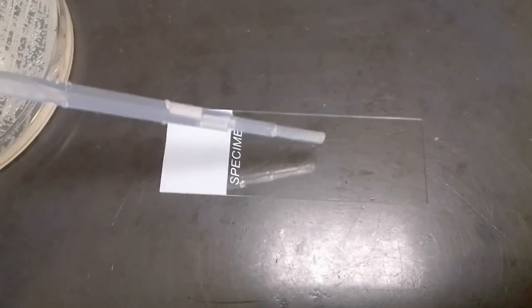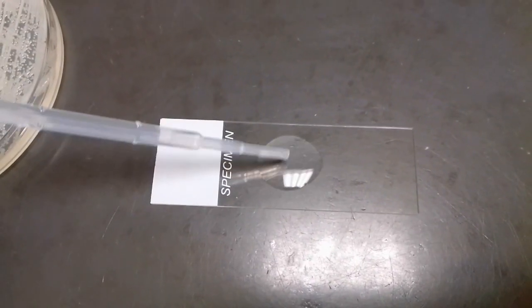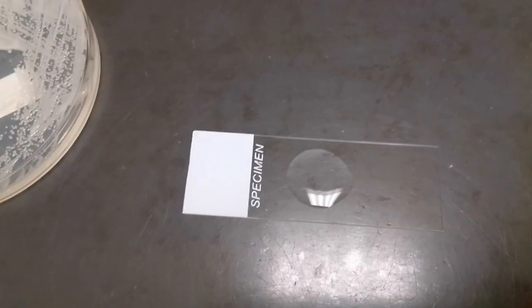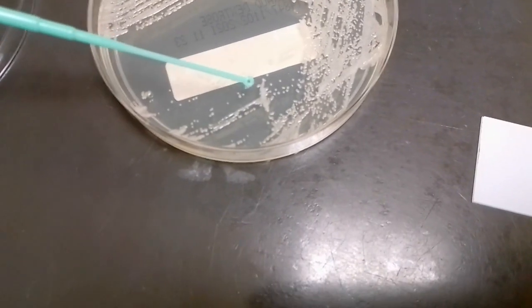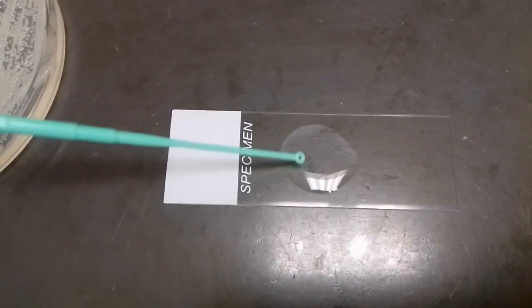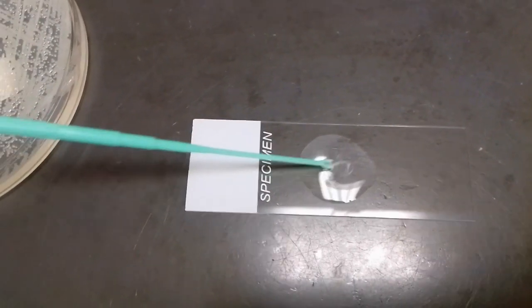Hey everyone, this is Dylan here and today I'm going to go over a procedure for doing a wet mount. The first step is taking your slide and adding a drop of water to it. You're then going to take a colony of your organism from the plate and mix that thoroughly within the water, then add your cover slip to the slide, and view that underneath the microscope — generally with the 40x objective lens.